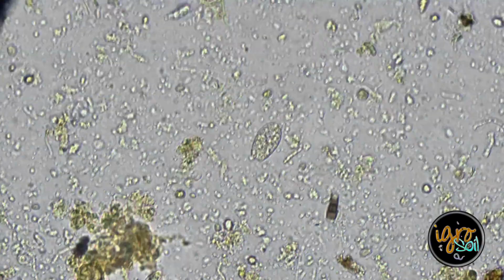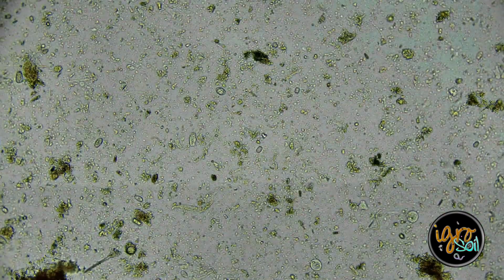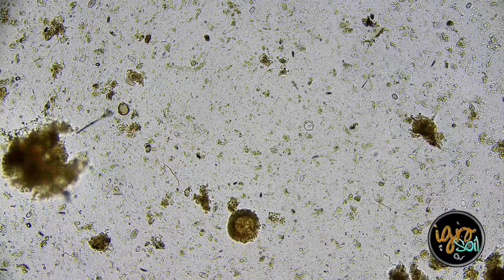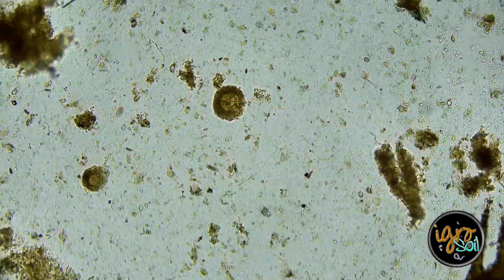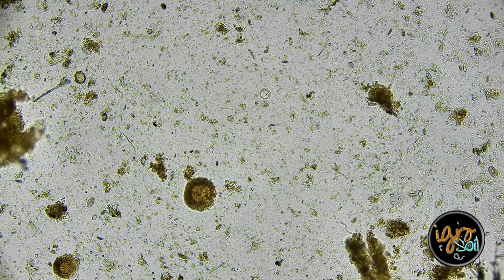So let's just keep going. I'm gonna back out a little bit. Let's go to 100 real quick, and there's actually a lot of testate amoeba in here. Something you definitely want. This thing is fulvic, humic, fulvic. I mean, all the colors are there. Look at how cool this is, whatever this is.